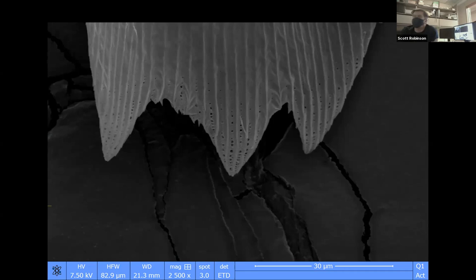And so what happens is when we use a sputter coater, the sputter coater has a thin film of gold palladium or platinum or whatever it is that somebody wants to coat their sample with. And so there's a disc that's about 2.5 inches in diameter, and that disc will wear out in the place where the gold palladium comes down to coat your sample. It also coats the inside of the chamber. And so eventually the disc will fall apart. A central part of it will fall out.